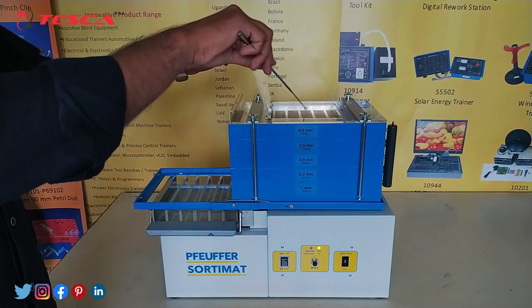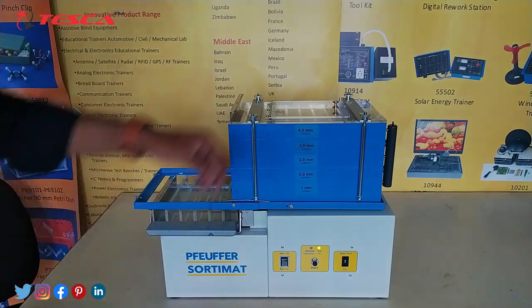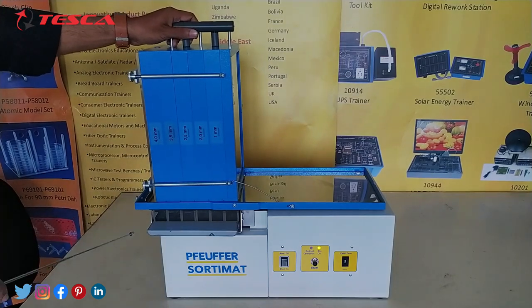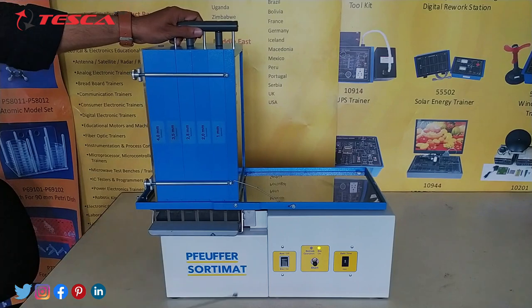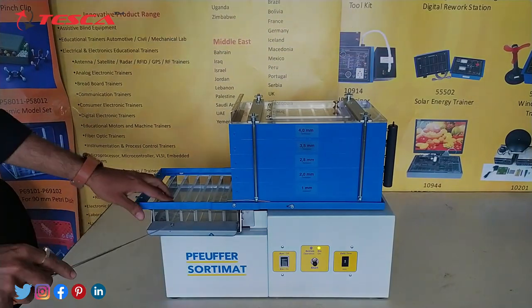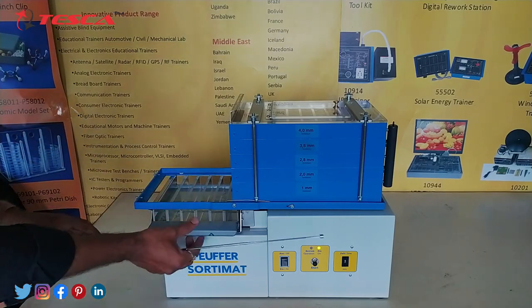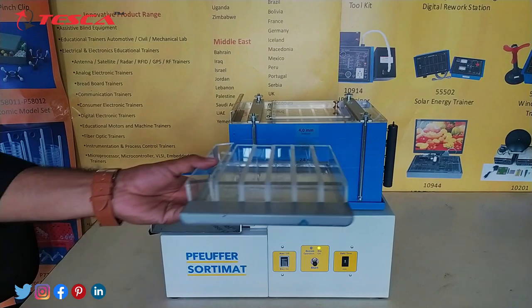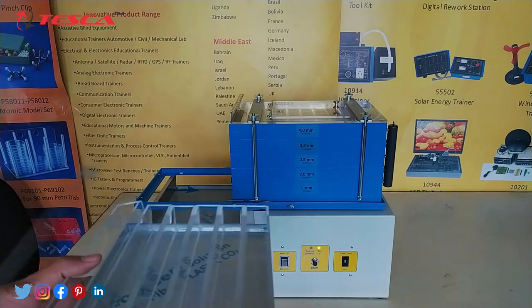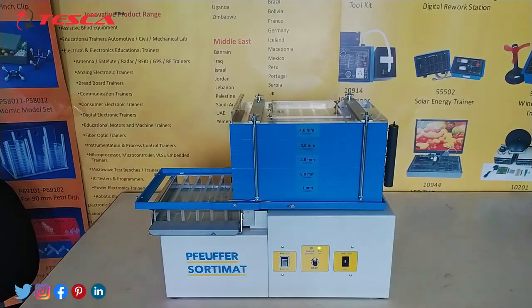Now whatever sample you have entered, the samples get sorted and we will get the sorted samples on the drawer trays. You can get the samples of 4.0 mm here, 3.5 mm here, 2.8 mm here, and 2.0 mm here. You can take the samples out by removing the tray and get the grains in different mm ranges.